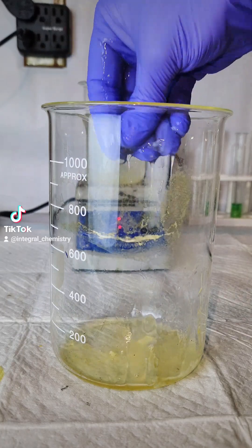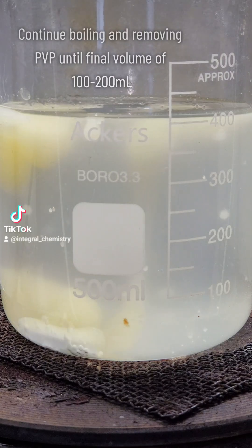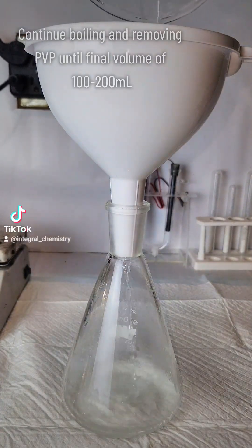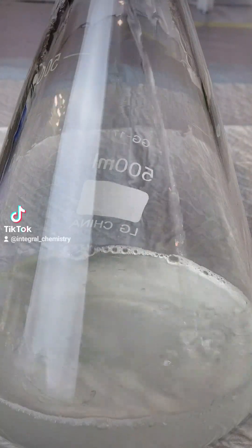From here on out, all I'm going to do is continue boiling down my solution until I reach a final volume of between 100 and 200 milliliters. The more the volume is reduced, the more povidone begins to precipitate out of solution, and I get rid of it every time by simple gravity filtration.